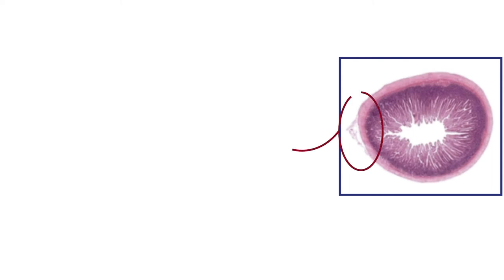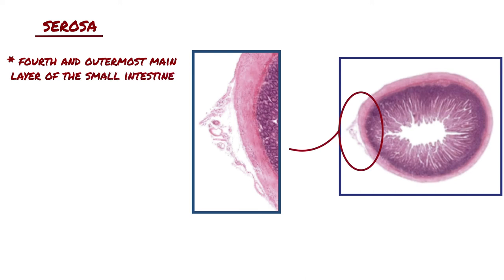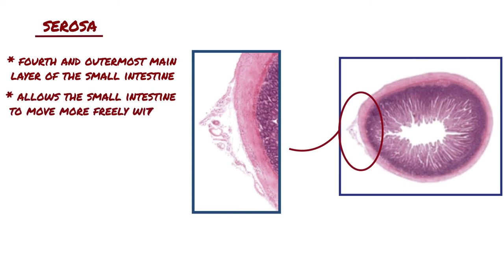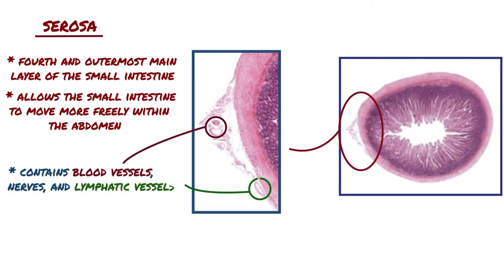Looking at the same image, we can see a portion of the serosa, which is the fourth and outermost main layer of the small intestine. The serosa is a thin layer of loose connective tissue that allows the small intestine to move more freely within the abdomen, and it contains blood vessels, nerves, and lymphatic vessels as well.